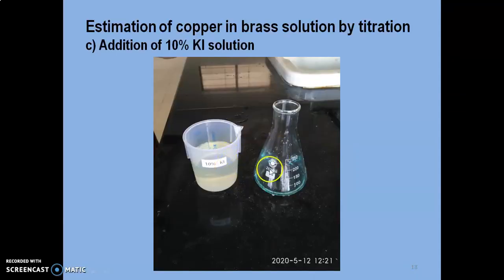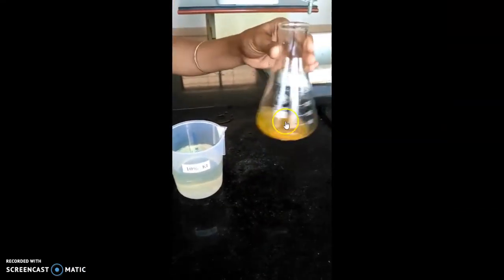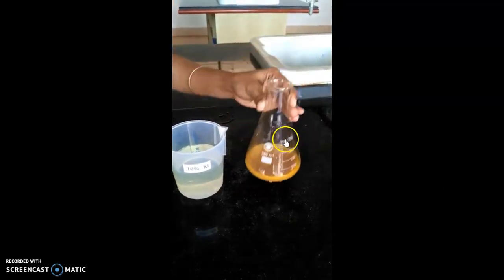Potassium iodide is added to the solution. 5 cm3 of potassium iodide solution is added that will impart the yellowish-brown color to the solution.